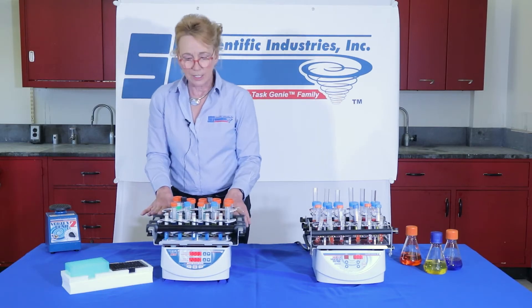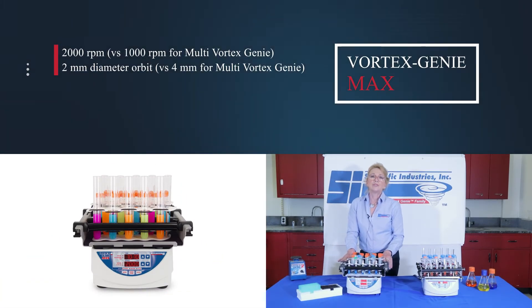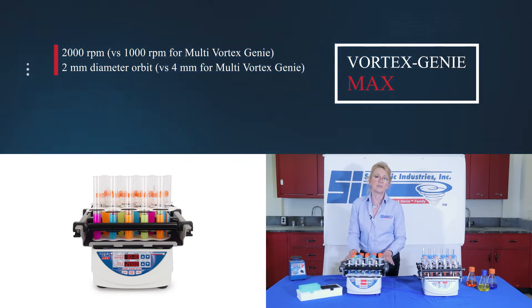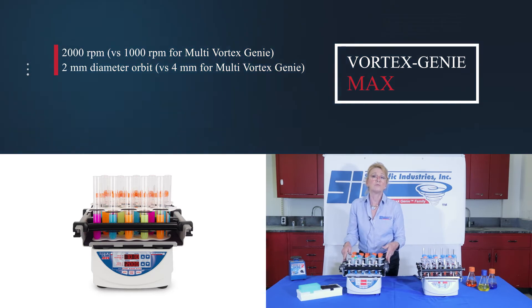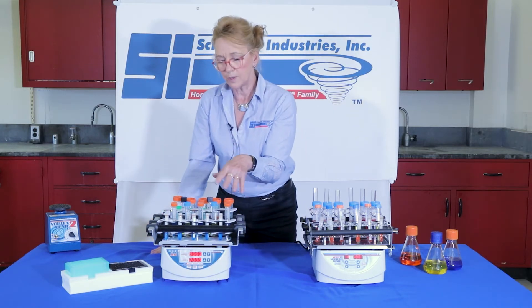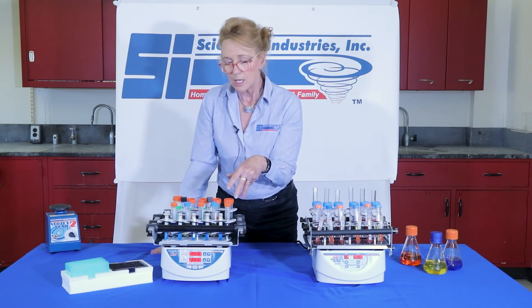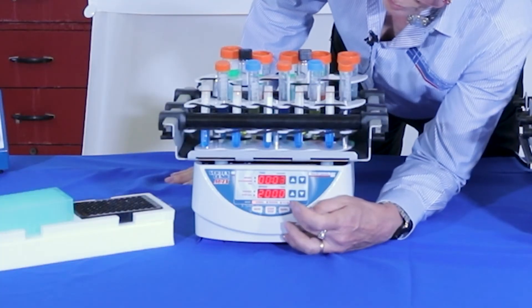Now we have the Vortex Genie Max. The Vortex Genie Max will go to 2,000 RPM. So we have 1,000 RPM versus 2,000 RPM, and a 4 millimeter diameter orbit versus a 2 millimeter diameter orbit — a tinier orbit. Right now I have the racks in here with various tooth sizes for the perfect demonstration, showing the versatility.